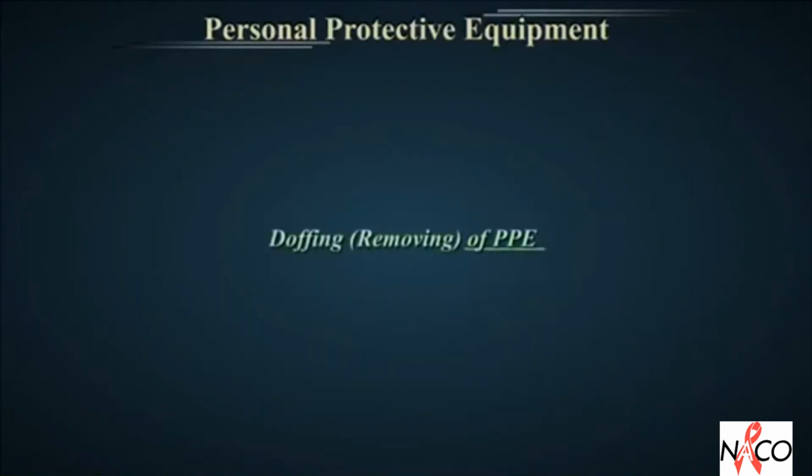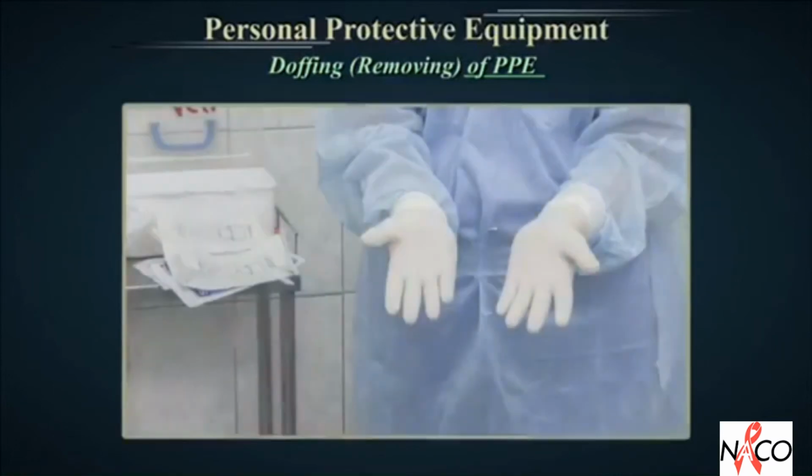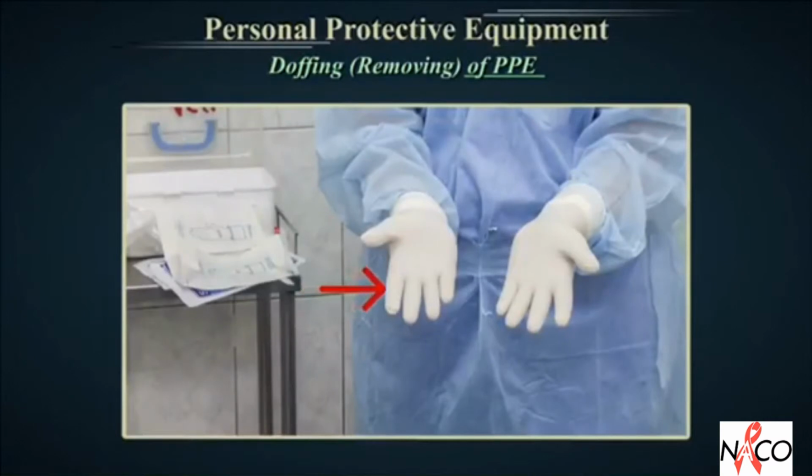Doffing or removing of personal protective equipment. All movements in doffing should be done in a slow and intentional manner. This is to prevent aerosolizing any pathogens released while doffing the PPE. The first step is doffing the gloves.